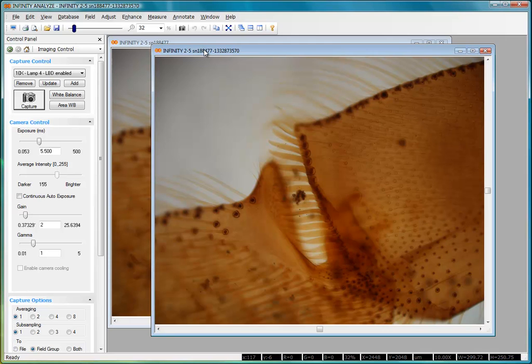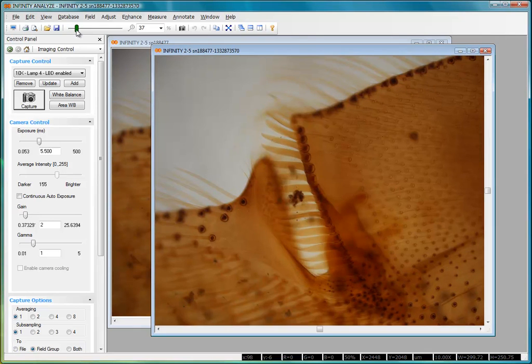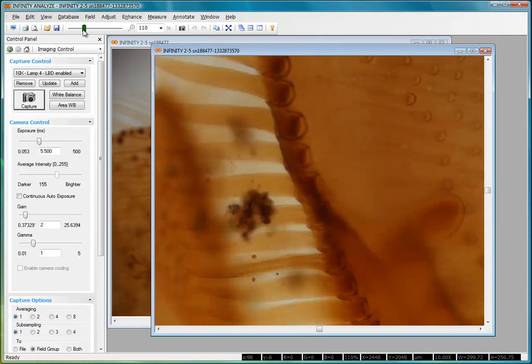The zoom function will take effect on whichever image has the focus. So clicking in the title bar gives an image the focus, and now selecting the zoom level.